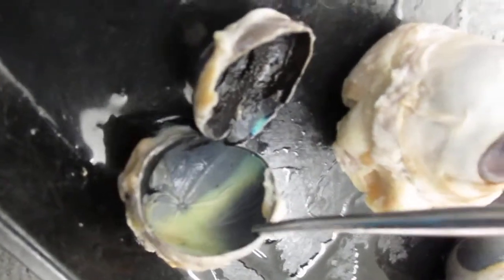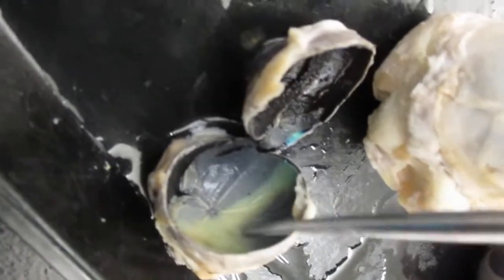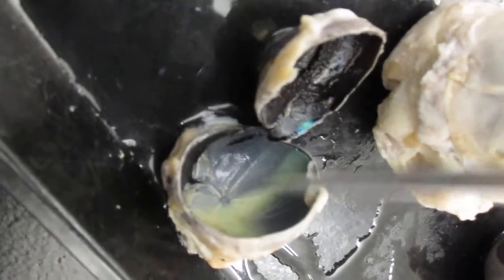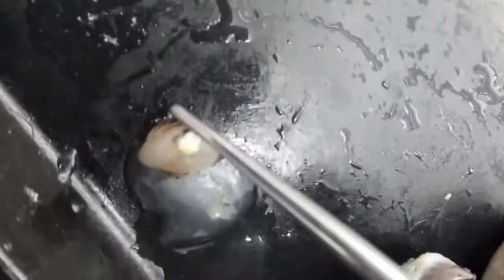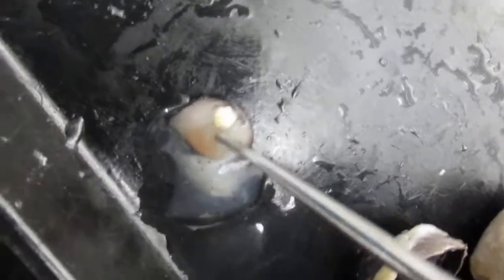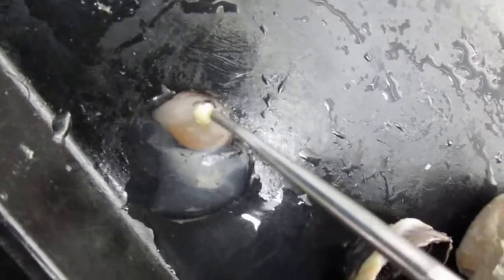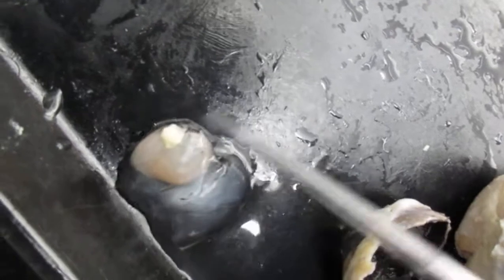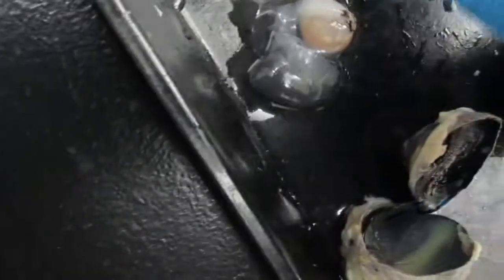You see this stuff right here, this white stuff right here? That's the retina. So this is the retina right here. This white stuff right here is your retina. Okay? Now, the lens is going to be clear in a live specimen. I know it's sort of tan color here. That's some fat right there or something, but I apologize. Let me remove that.